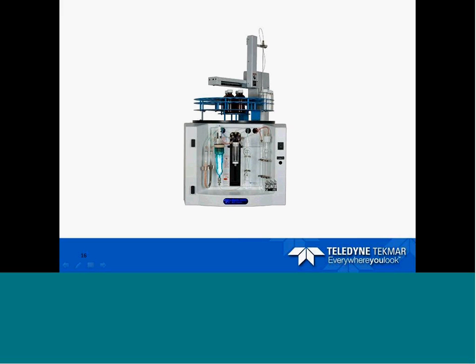This is a quick snapshot of the instrument with the front cover off. Over to the left here is our halogen scrubber. Because we're measuring CO2, the detector and everything can be affected by halogens. So to prevent any analytical errors, the halogen scrubber helps to remove any chlorine and other halogens from the carbon dioxide before it enters the detector.